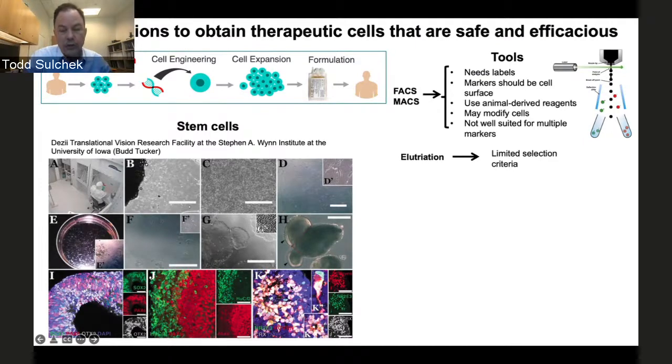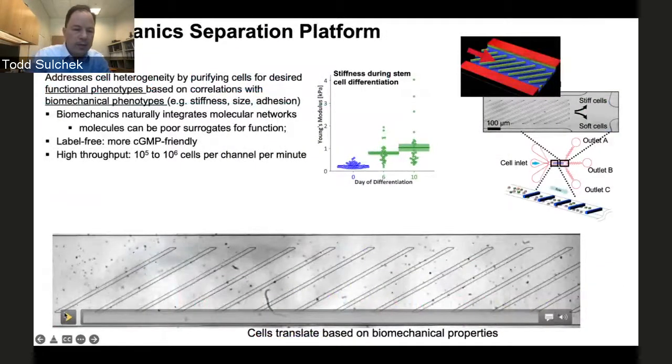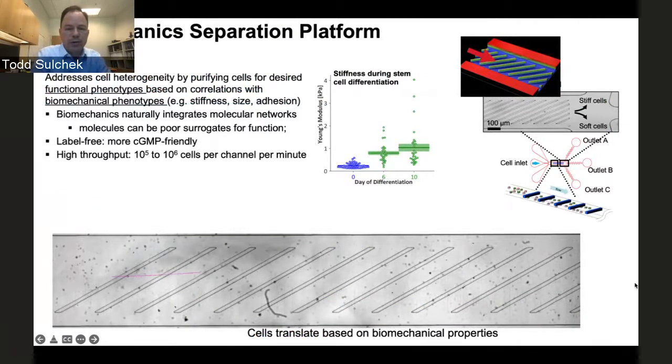And then 150 days later, you start to generate your photoreceptors, and again, you have quite a big disparity of variation. Some of those cells are needed for support, and some of those cells just inhibit engraftment. And so you want to be able to select the cell types that you need. And same with immune cells. Typically, you just want one cell type. So we developed microfluidic cell sorting platforms that can sort by biomechanical properties. And it turns out that many of the cell types of interest can have distinct biomechanical properties, and that by doing these label-free sorting, we can then collect them.